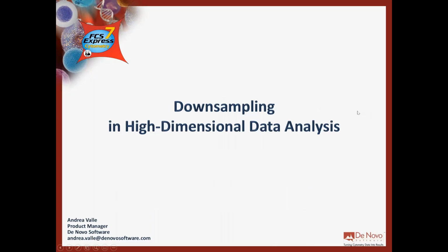Okay, so this is the second topic that I want to address today. Again, remember, we start by introducing the pipeline. We introduce the scaling. We spoke about the normalization, and you can immediately see that scaling is 99% of the time useful. Normalization is more tricky. Okay, it might be useful.